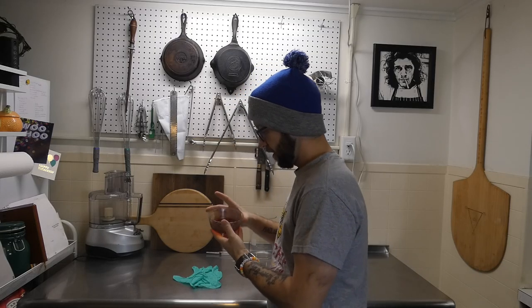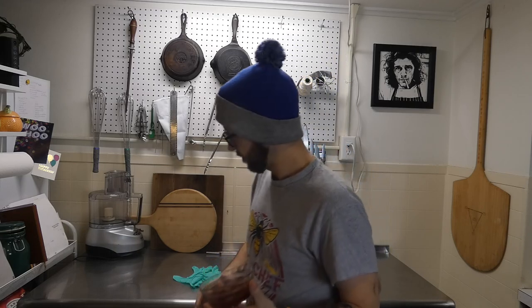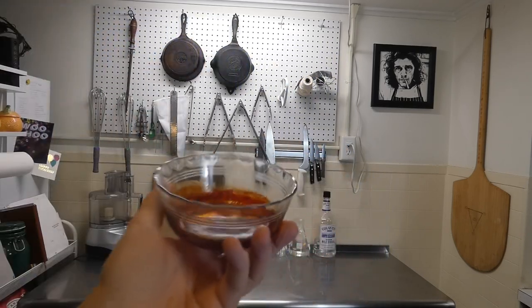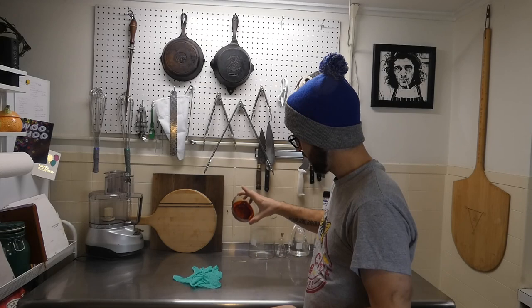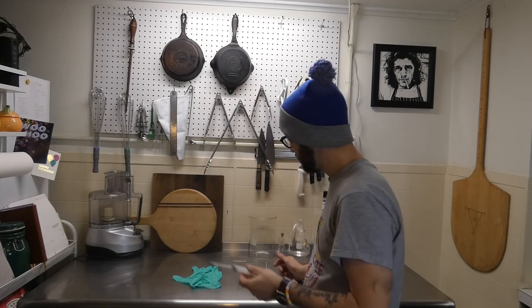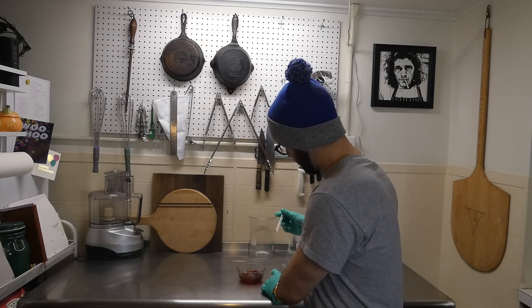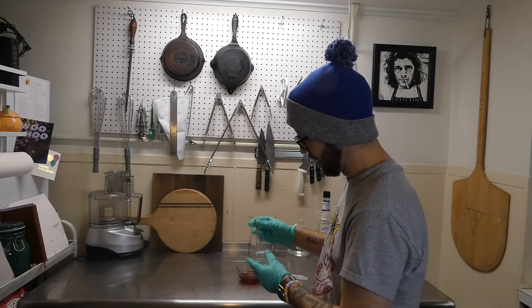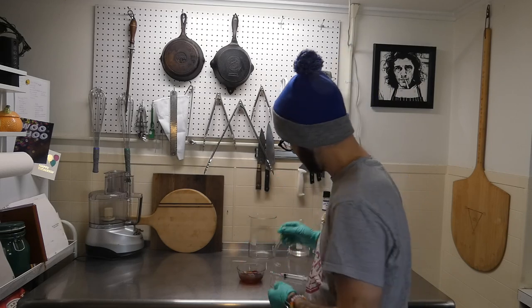Alright, the ethanol has completely evaporated out of this. Not sure if you can tell, but it's quite goopy. So the easiest way to get this out is going to be with a syringe, I think. So, glove up. I have a little test tube with a stopper here. I'm just going to keep it in here. I don't have any little vials, so this will work just as well.